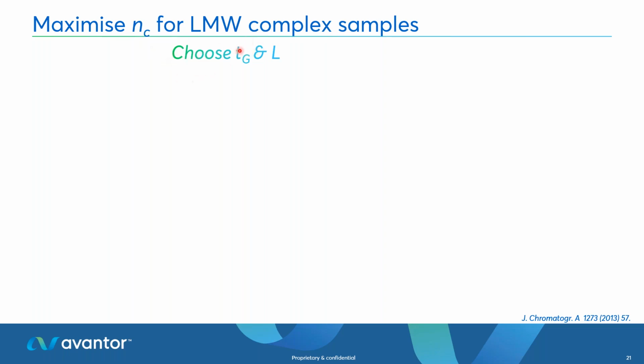So again, similar to that gradient time decision, please take more responsibility in this gradient time decision. Talk to your lab members who are sharing that instrument that you use. Understand how much time you can dedicate to every injection for your sequence, and that will give you a very good number or gradient time to choose for this first decision.